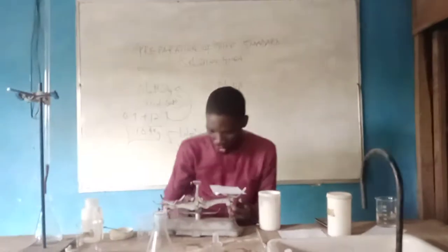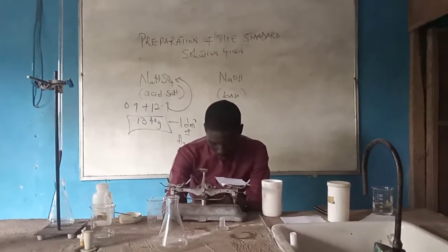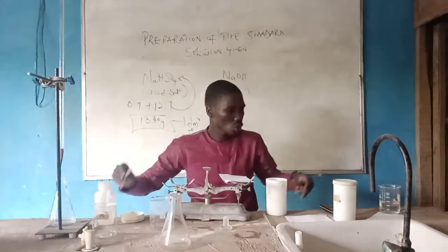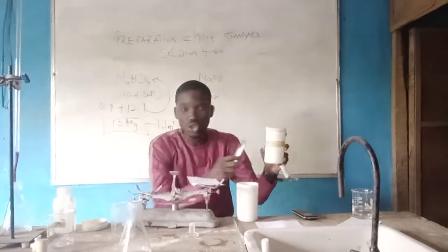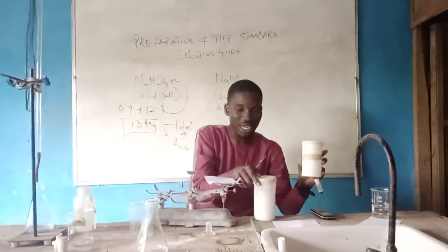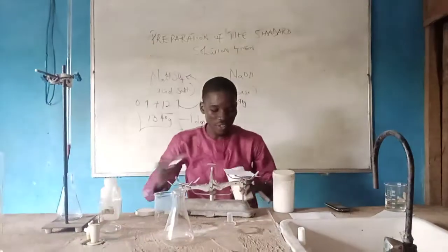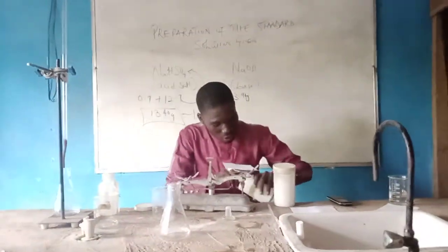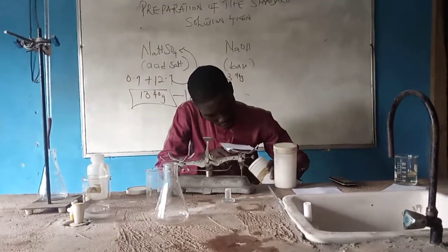You pick a little portion, move this back to what? 1, 2, 3. So we have 9 here. So this is our salt. You can see it is labeled what? Sodium hydroxide. It is labeled what, class? Sodium hydroxide. So don't forget to dissolve this particular one in how many ml? Wow. I think this salt is.